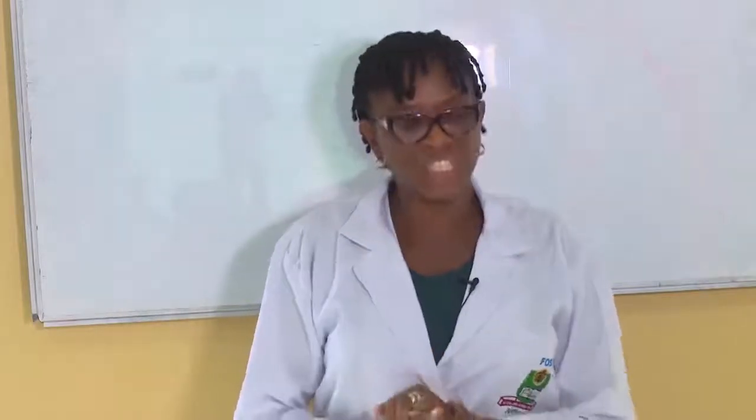Now, we need to take into consideration some safety tips. Remember, the laboratory is a place filled with glassware and a lot of corrosive chemicals. So it is important that when you are in the lab, you take great precaution and avoid spilling chemicals on your skin. Now, let's go to our experiment.